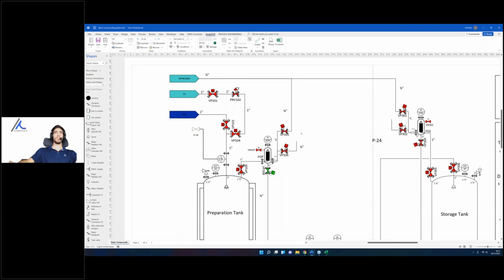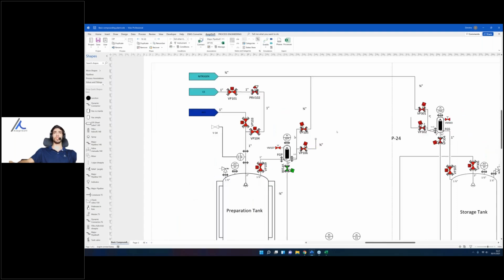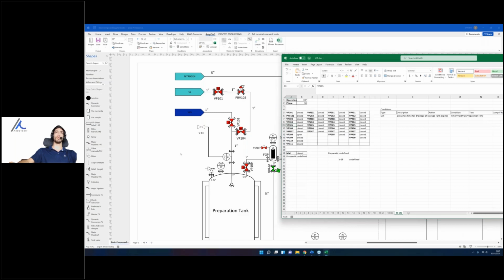So first of all, let's imagine we want to make a change, but this is just a geometrical change, a very simple one. Well, in a manual way, once you have printed your paper, you should start drawing everything again. But this is just a simple example. Imagine you change more geometry. Then applying the changes, it's going to be a nightmare. But here you don't have to do anything. It's already saved and stored in a smart format, and you don't need to do anything. It is already good to go and available to export.